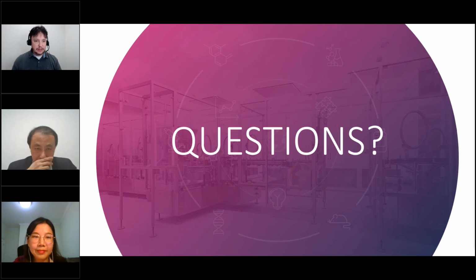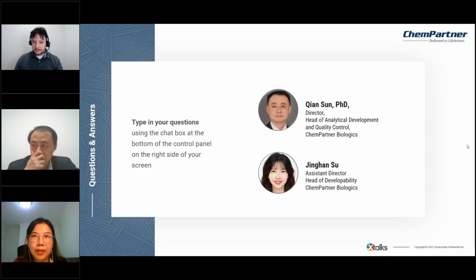All right, very good insight. Thank you. Now, in the stability study, how do you select the buffer system of the candidate? Okay. Firstly, it depends on the isoelectric point of the antibody. The pH value of the buffer should be away from the isoelectric point by about 0.5 to 1. According to this value, we will choose an appropriate buffer system to cover it.